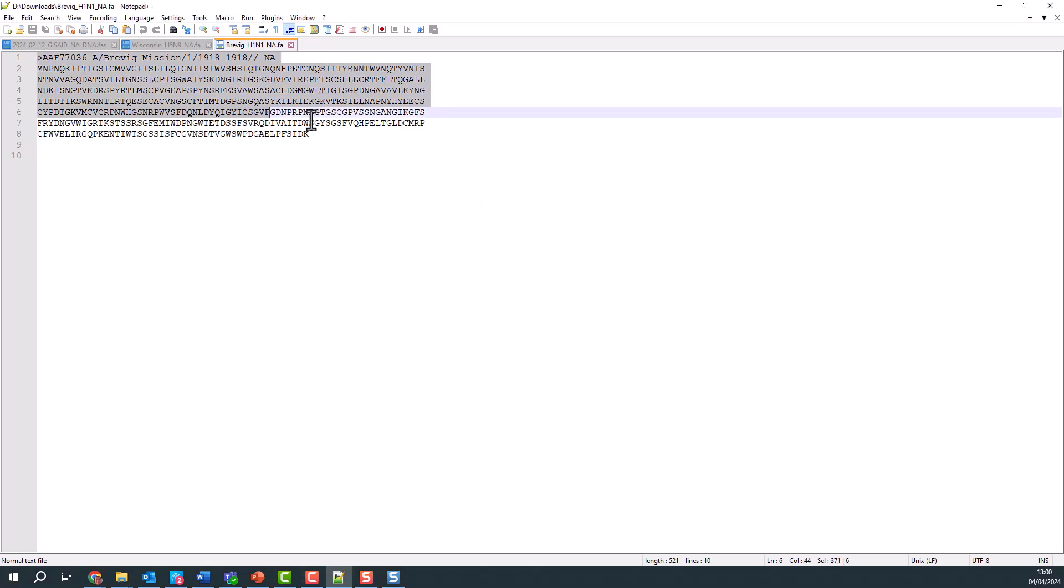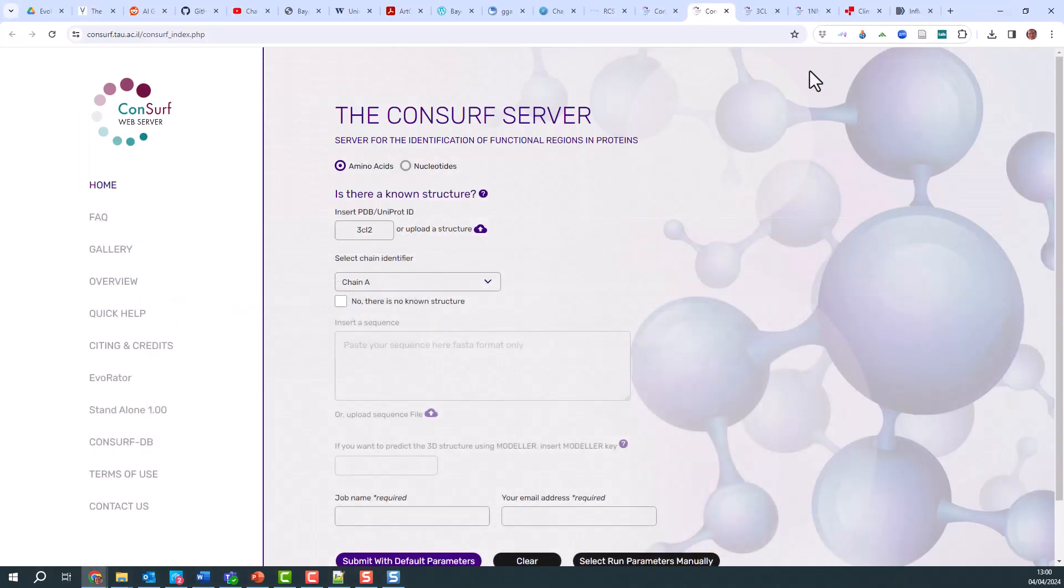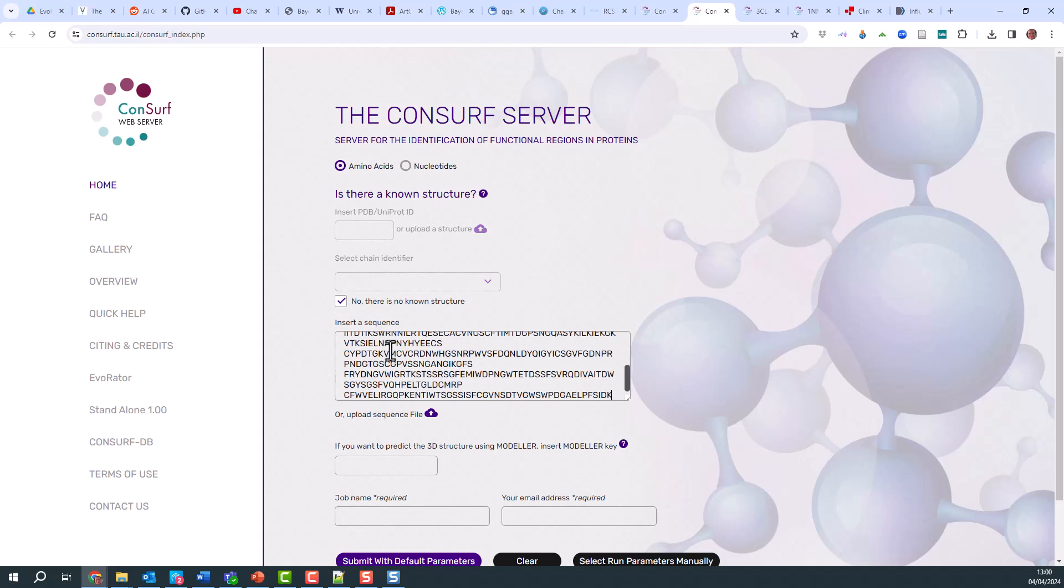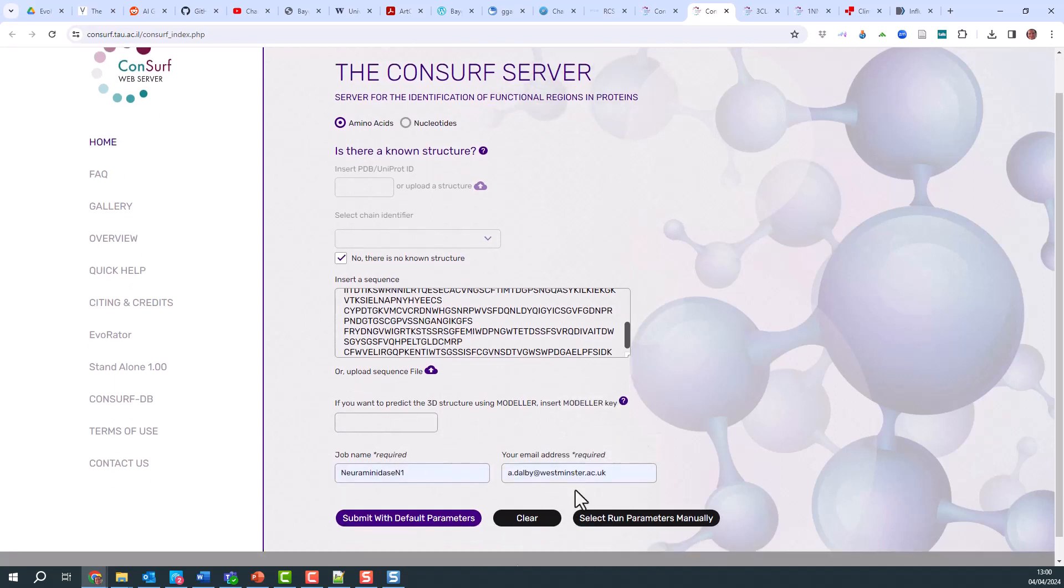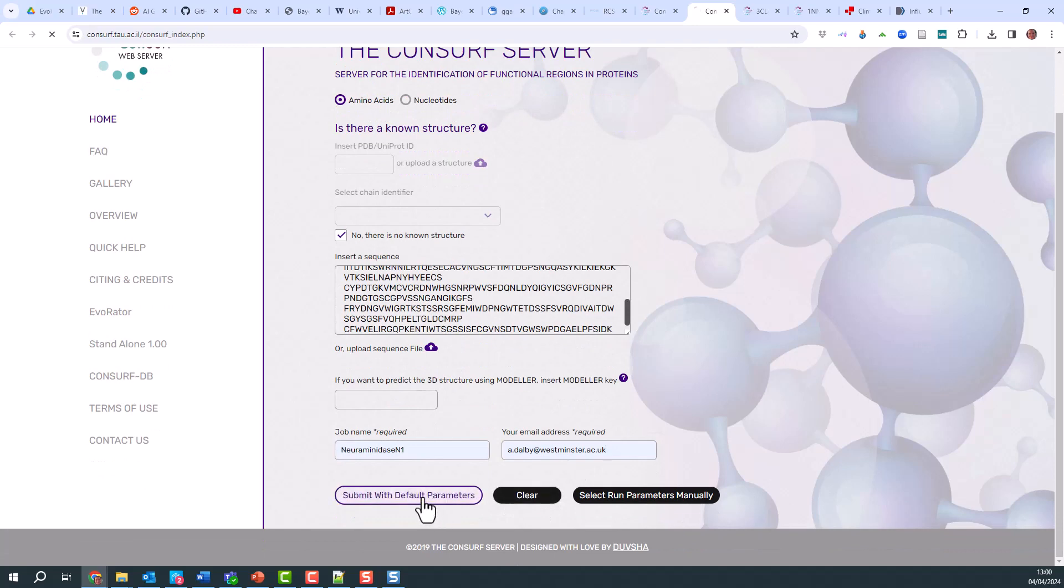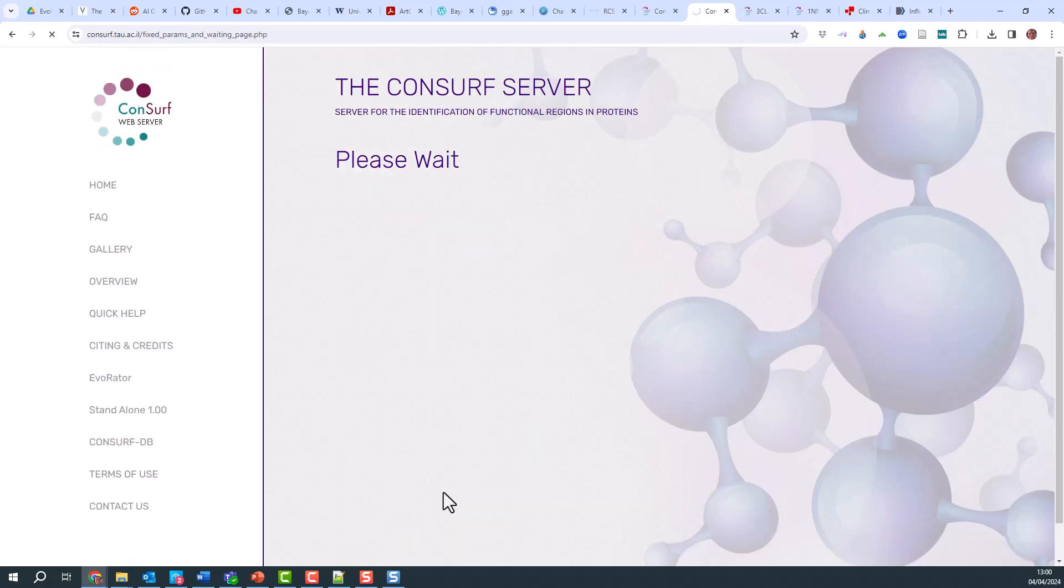Here's the fasta file. If I copy it, and then say there's no known structure, paste it in, give it a job name which is neuraminidase N1, my email address as usual, submit with the default parameters, and let's see what this gives us.